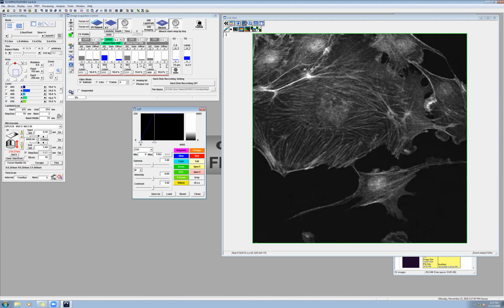And let me go back. While we are at this point, this is a good point to talk about a few things. You remember I told you that the other button which I like a lot is the information button, the I button over here.